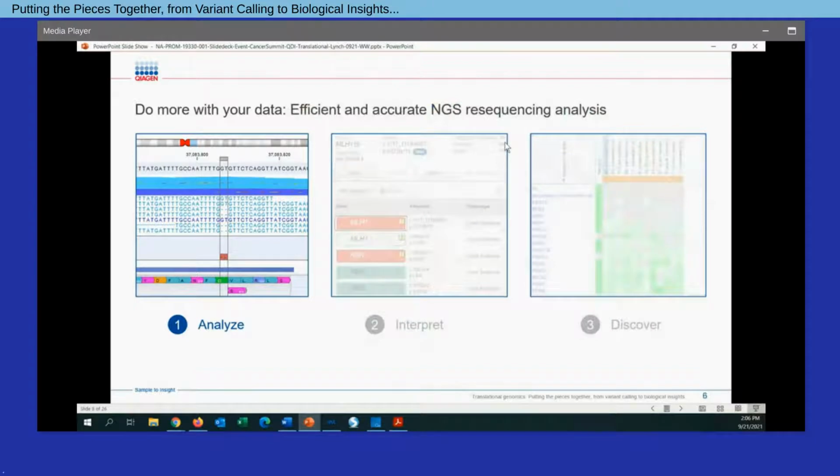For the first product, CLC Genomics Workbench, essentially this tool represents the ability to process raw NGS data and get to various endpoints. In our focus for today, we're going to be talking about DNA-seq analysis on a targeted panel, and in that context, the endpoint would be calling variants. But the software platform also supports other research endeavors. If you're generating, let's say, RNA-seq data and you want to look at gene expression or fusion information, the platform can support that as well.